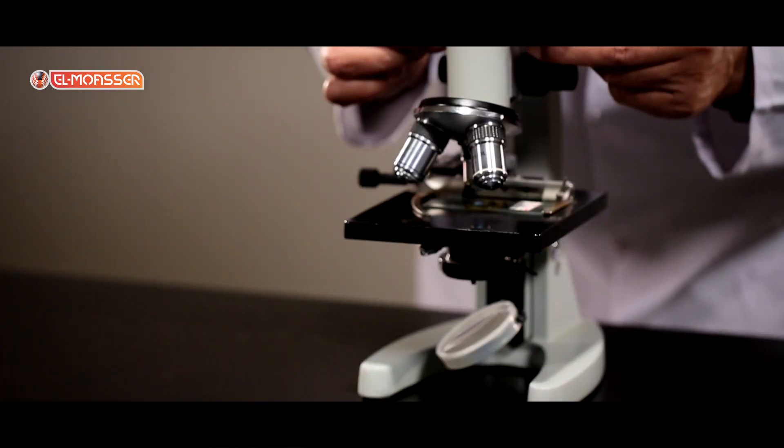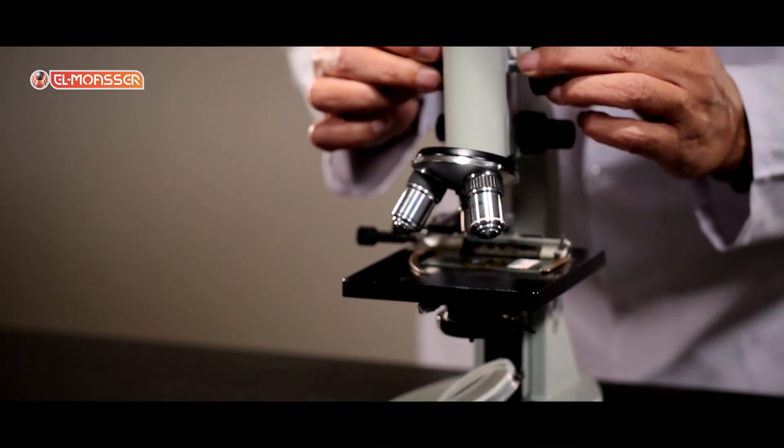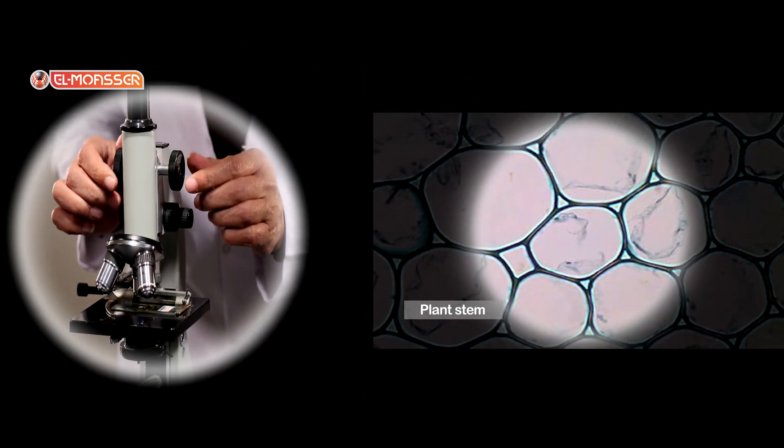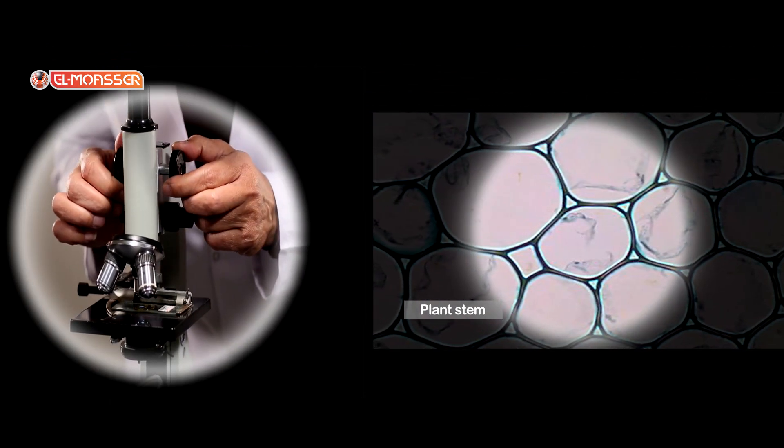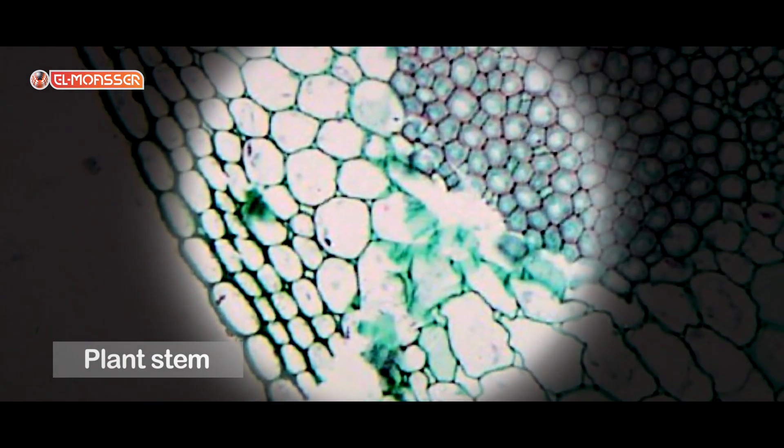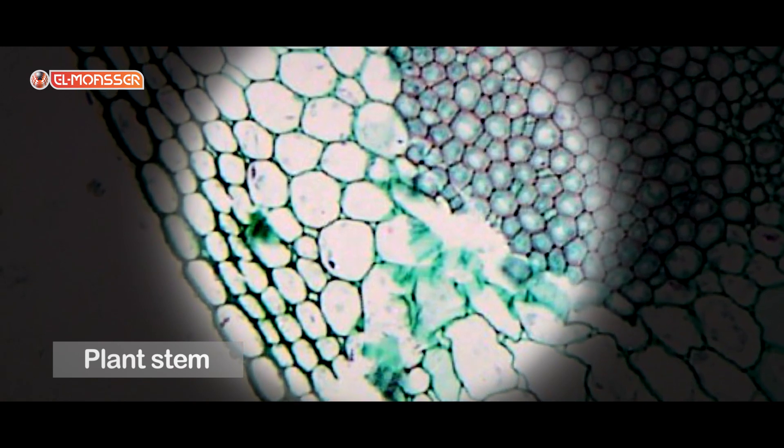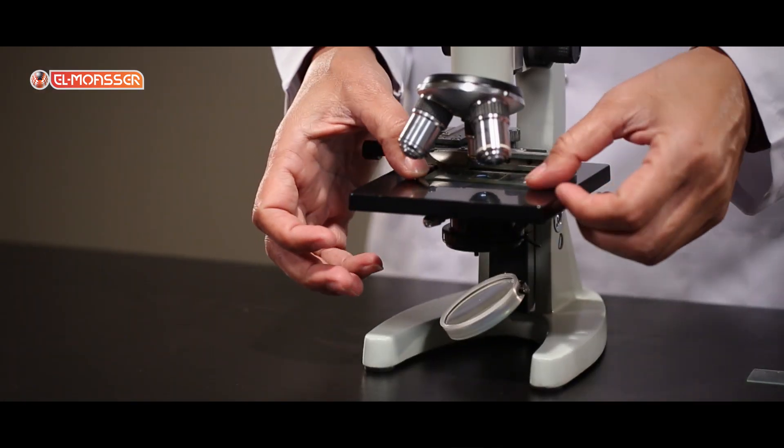Move the coarse adjustment to get the clearest possible image. The first section is of a plant stem. Observe there are a group of parenchyma cells and colenchyma cells. These are from the type of plant cells.